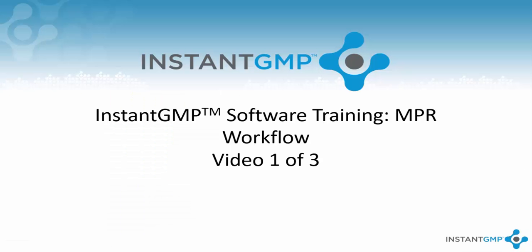With the completion of the project section of the software, we will end the video here. Next time we will go over the intricacies of creating an MPR within the InstantGMP software.